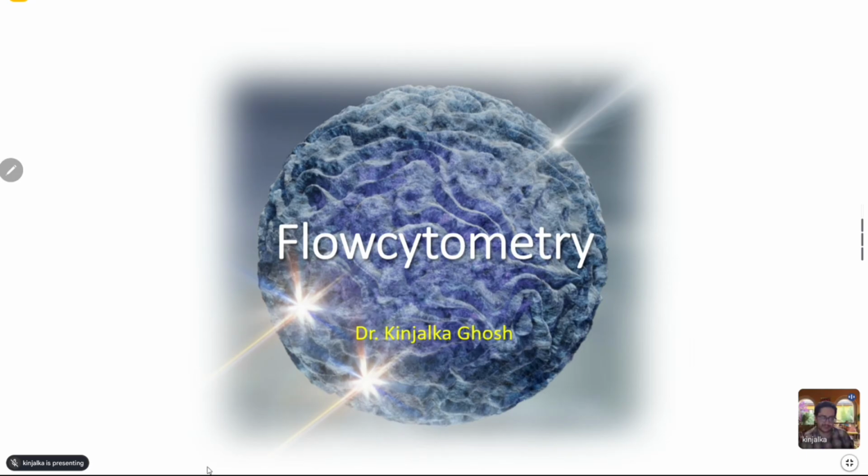So we'll continue. Flow cytometry is basically a technology, and when you see our previous lectures, this is very different. It's a technique or technology that we're talking of. And when we talk of technologies, we need to understand two, three things. One is the instrumentation part, and second is the application part. And then you have the limitations, advantages, disadvantages, and so on.